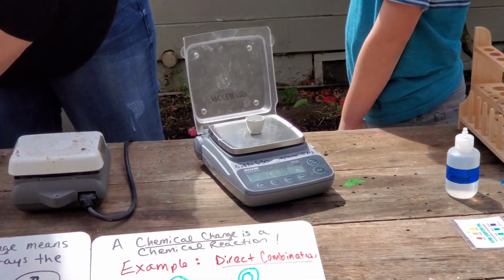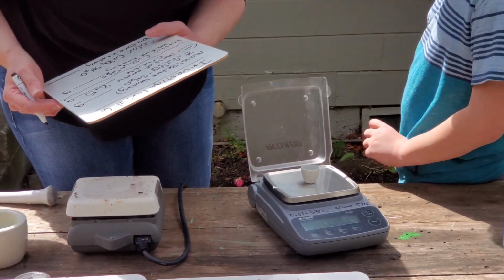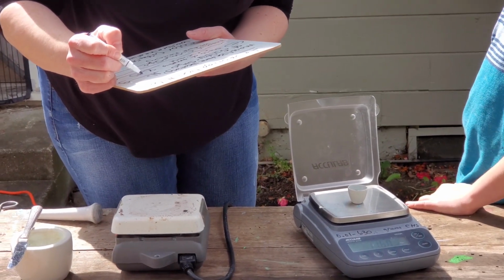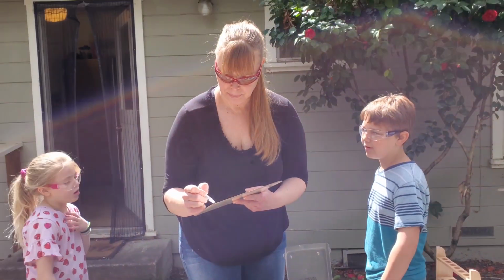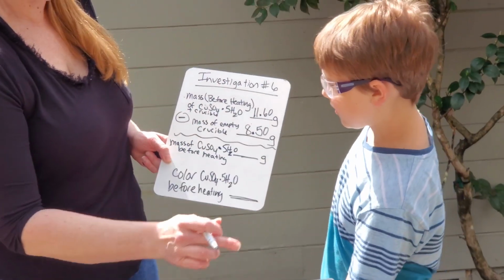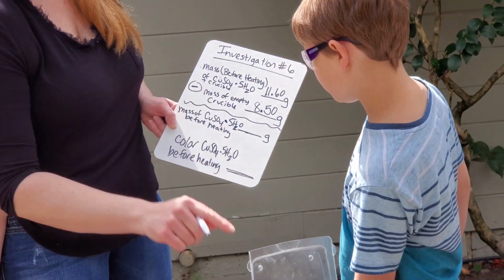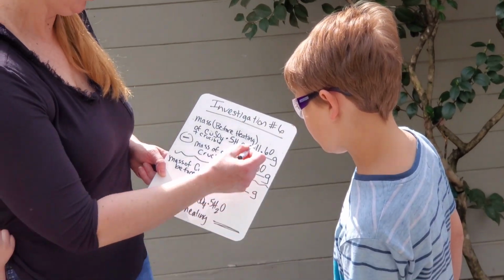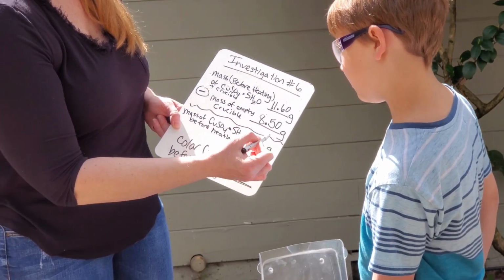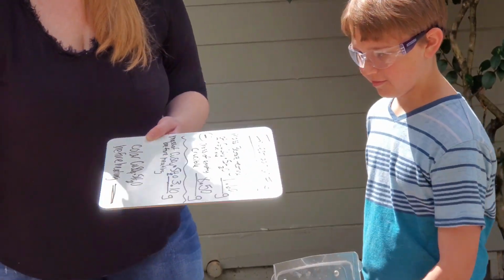Okay, Troy, what's that number? 11.60. Okay, so we're going to do some math here. We've got 11.60 grams is the crucible plus the powder minus 8.5. How much does the actual powder in there weigh? So what's 0.6 minus 0.5? It's 0.1. And then 11 minus 8, 3. Correct, Troy. 3.1. He said it faster, sorry.